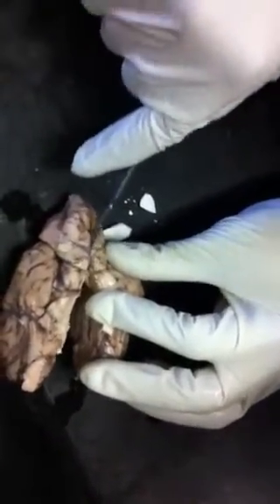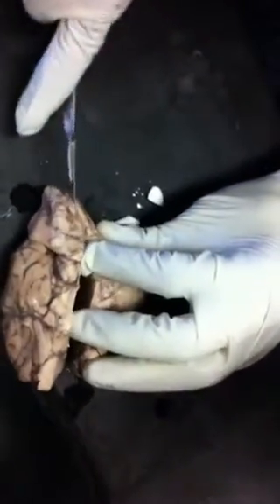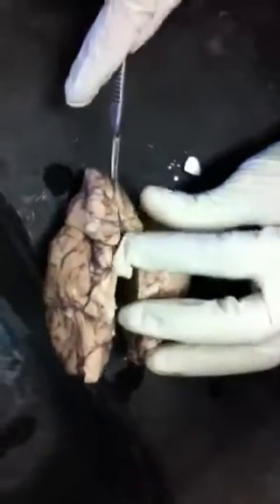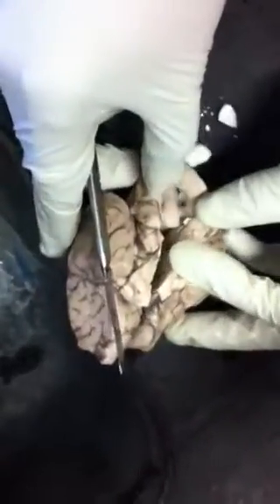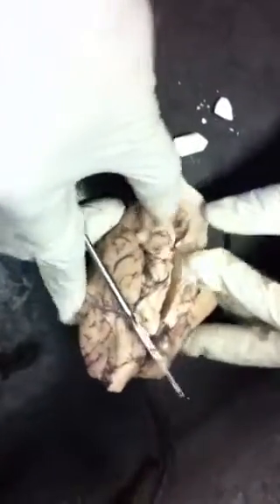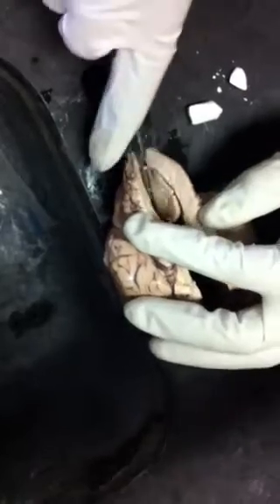Good thing I'm tall. I just cut the pons, now I'm cutting the medulla, dividing it, then the spinal cord. Now that's the cerebellum behind the brainstem. I'll cut it in two also. Great. So many people are doing it.